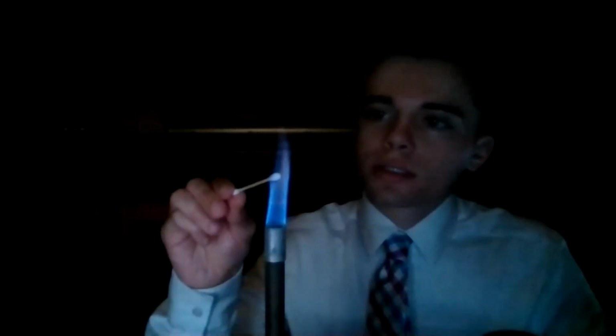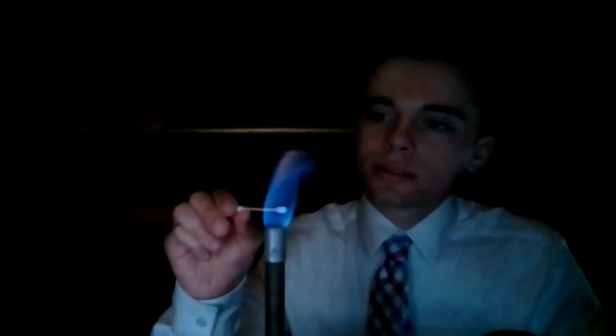Let's see. Come on. Come on. Do you kind of see it? It flares up every once in a while.